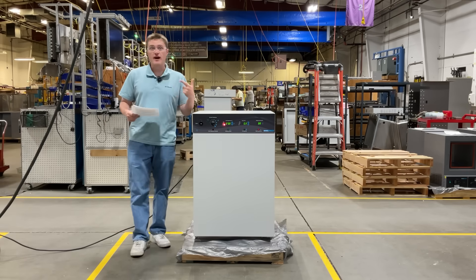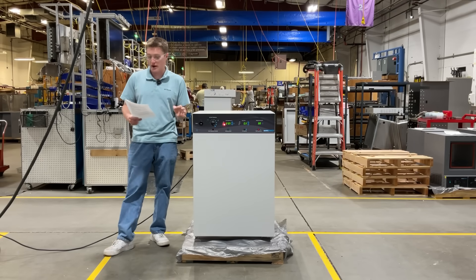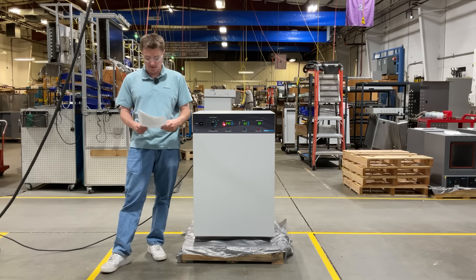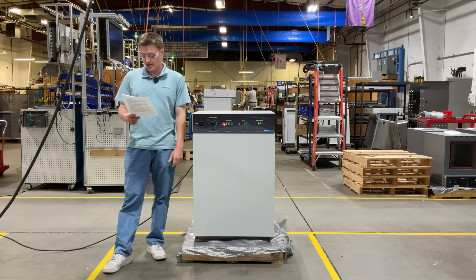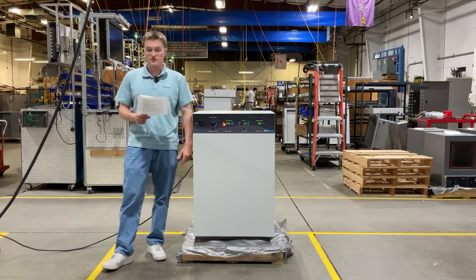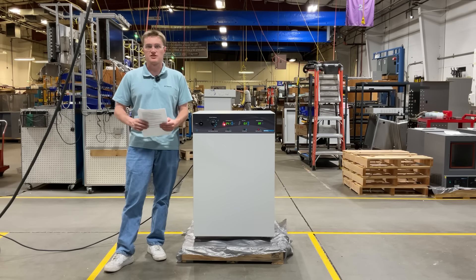The SCO5W CO2 Water Jacket Incubator from Sheldon Manufacturing stands out as a value-added investment for laboratories looking to optimize research outcomes while ensuring long-term reliability. This product combines advanced water jacket technology, precise CO2 control, and superior contamination prevention, making it an ideal choice for cell culture, pharmaceutical research, clinical studies, and microbiology applications.